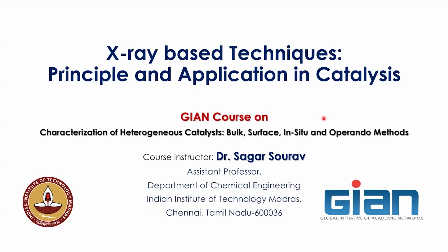In the last few lectures that I delivered, we were talking about how the catalyst is really dynamic during the reaction condition, and why we need to know about the dynamics of the catalyst. That gives us information about the state of the catalyst at the surface, its behavior, the nature of the active sites, and how that is affecting the overall reactions. So, today we are going to start with the X-ray based techniques.